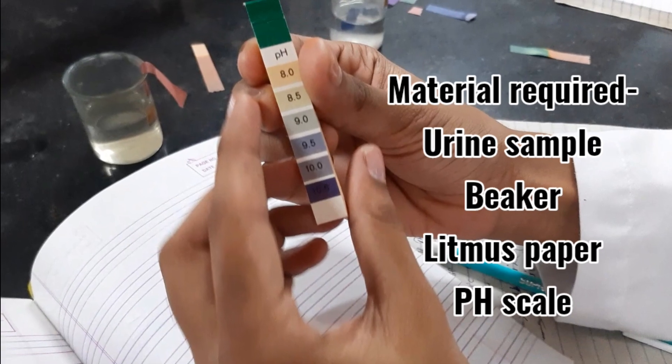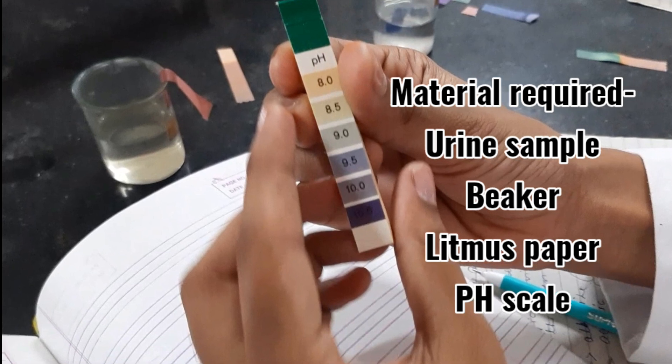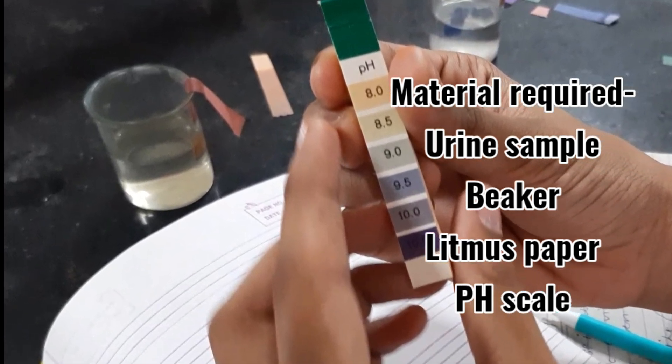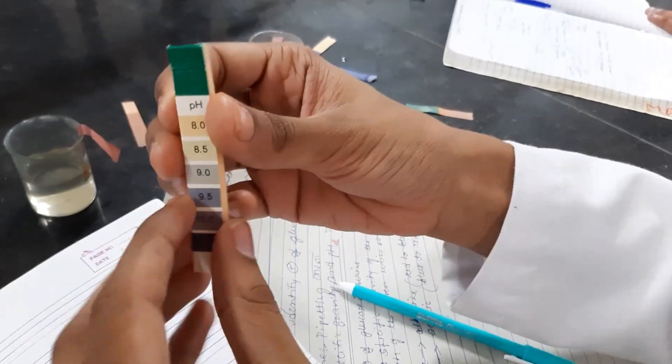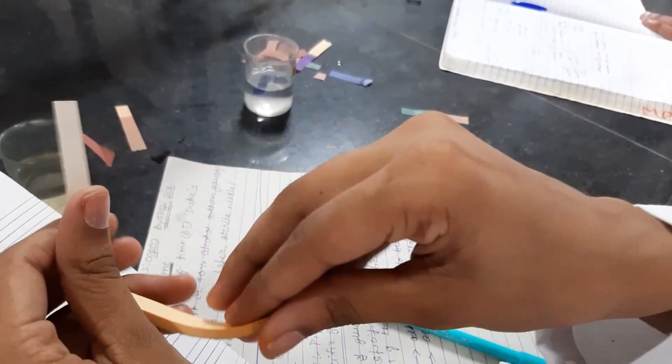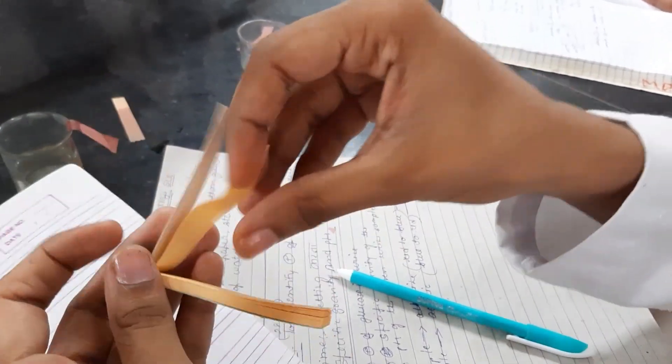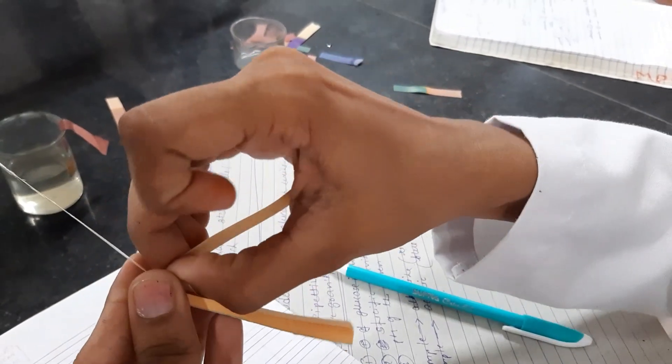Material required is urine sample, beaker, litmus paper, and pH scale. This is litmus paper and we will take one litmus paper from it. This is red litmus paper.